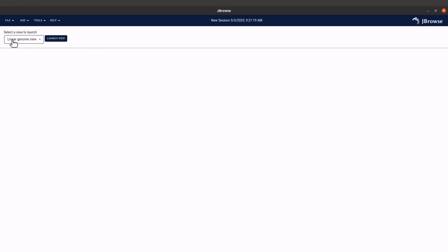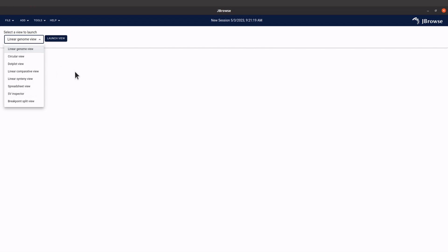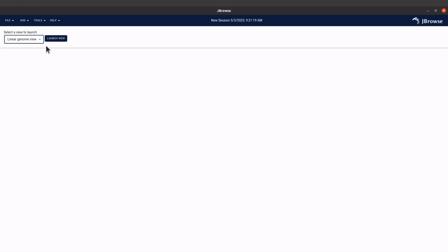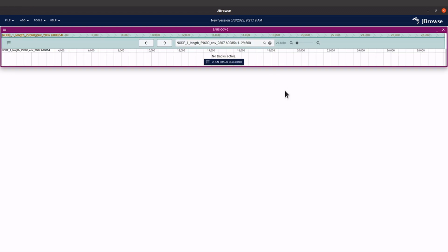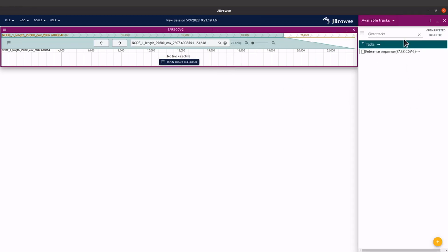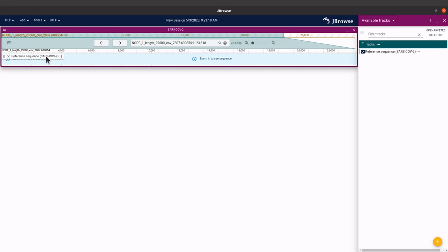After submitting you'll see a window — make sure Linear Genome View is selected. You can experiment with other options, but let's keep it this way. Click Launch View and then click Open. You'll see a message saying no tracks are active — even though we've loaded the data we need to select a track to display it, so click Open Track Selector.